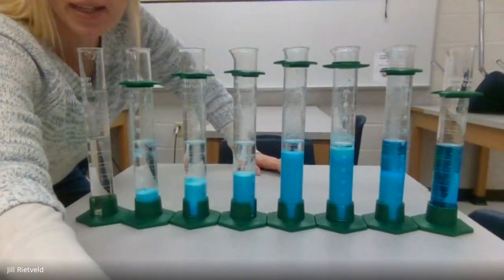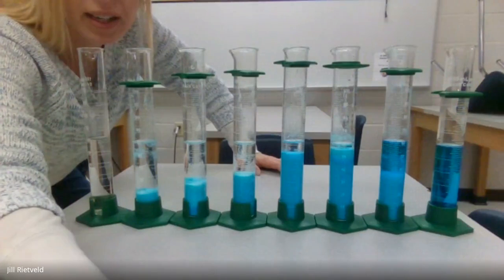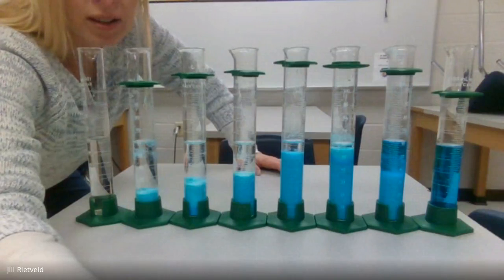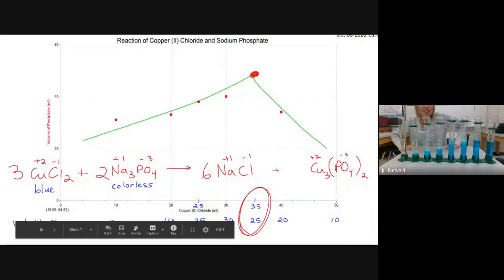It might take a minute, but we should be able to find this graph. Cool. Okay, so here's my graph, this one. And I can make it bigger so you can see it better.